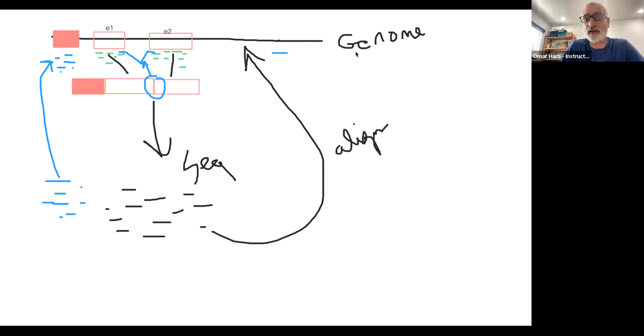There are going to be a bunch of reads that are going to align right here, and then you might look at this and say, wow, next to my gene there's another potential gene expressed, and on this side of the gene it looks like there's potentially another exon that belongs to my gene, because I see there are reads in this region, and there are also reads that are split between my exon 1 and this upstream hypothetical exon, right?